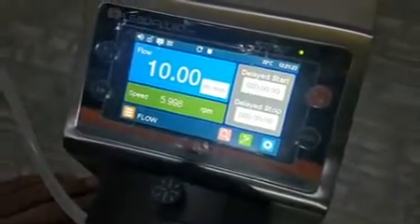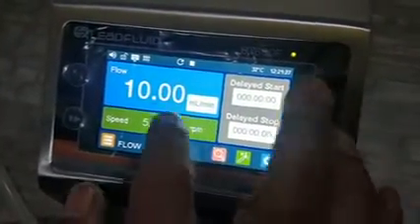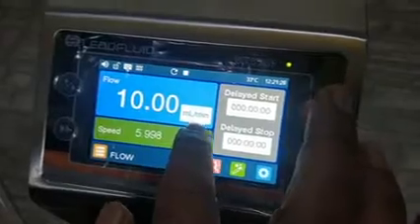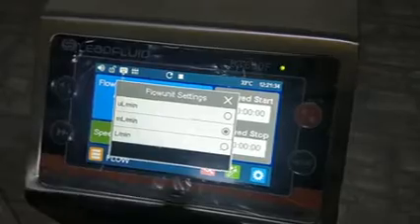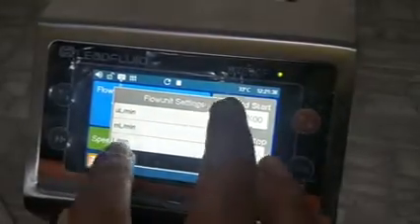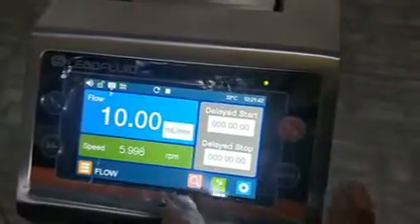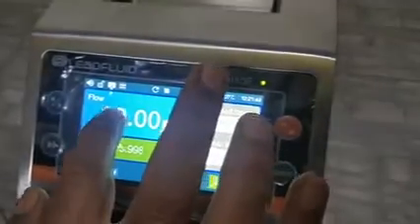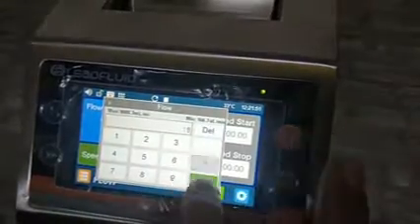You can also change the flow unit: micro liter per minute, mL per minute, or liter per minute. I am selecting mL per minute and setting the flow to 10 mL/min.